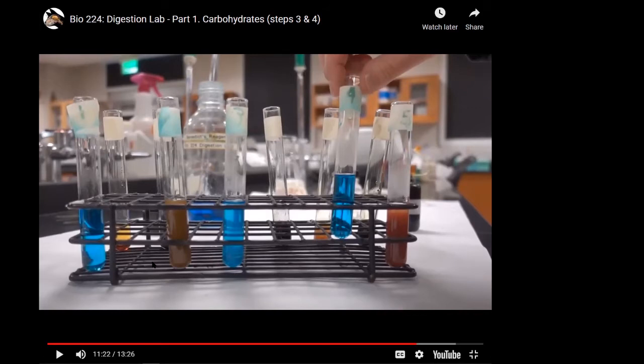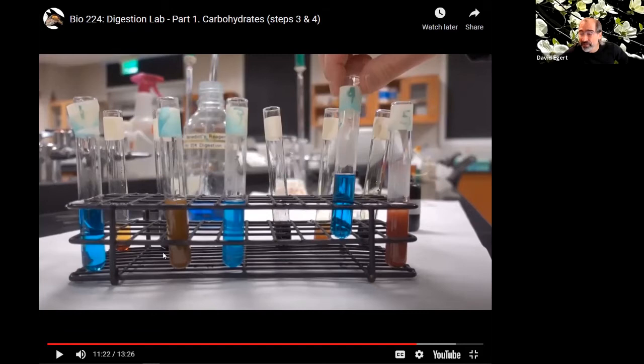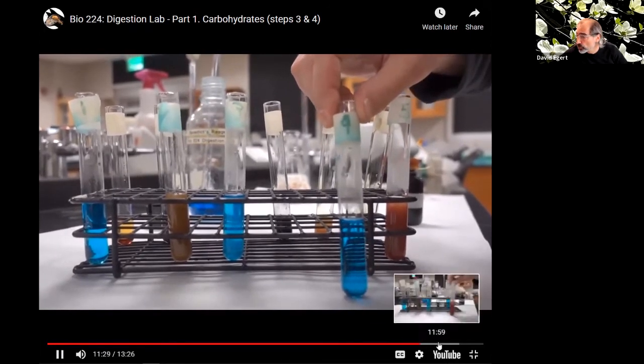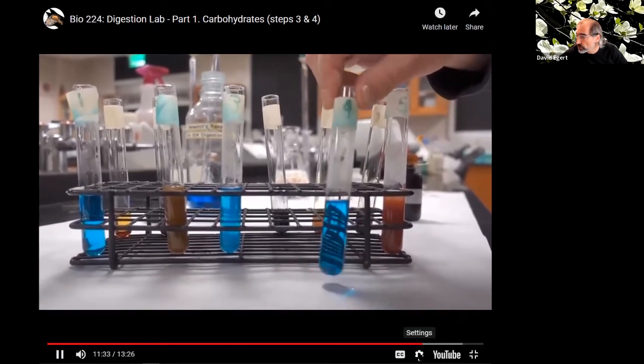Maltose? Absolutely. This is maltose. So this is evidence that, all right, probably the starch did break down. It's kind of what we were hoping to see or expecting to see. This Benedict's is blue. Initially, it stays blue if there is no evidence of maltose or any of these reducing sugars. And so this is what we were hoping.